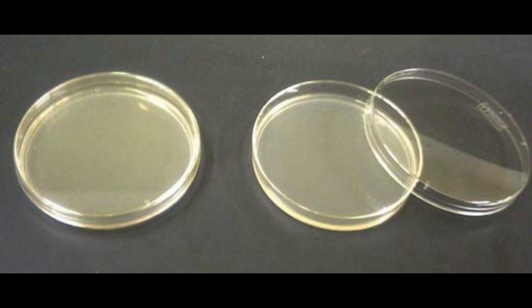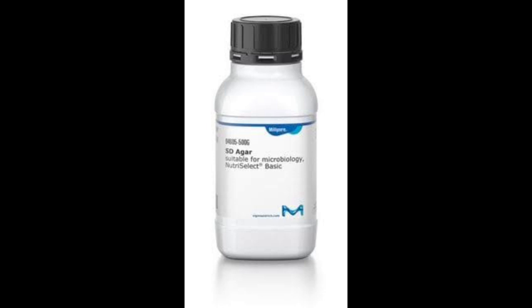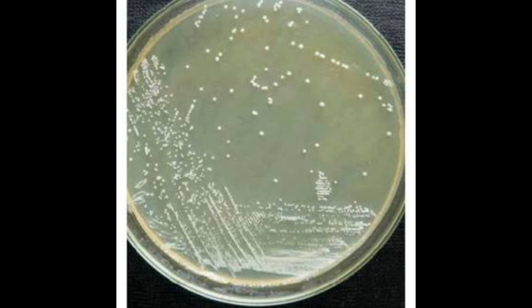Agar is a gelatinous compound. It is a kind of jelly which has a unique property. When you heat agar, it will become liquid, but after heating, you let it cool down, and it will become a solid. By adding something inside agar, it can be any kind of media.